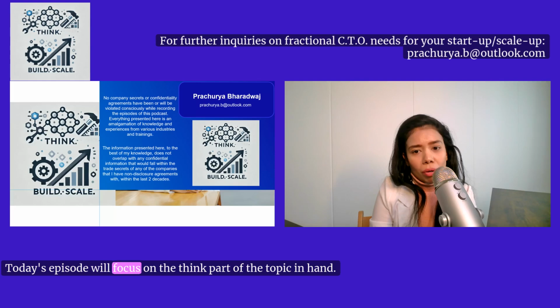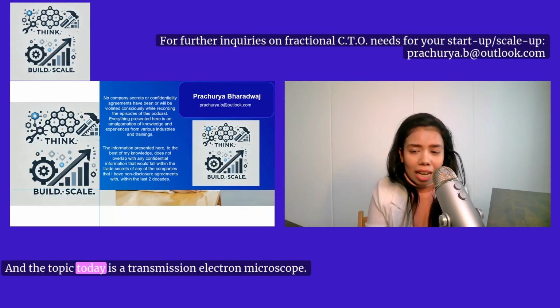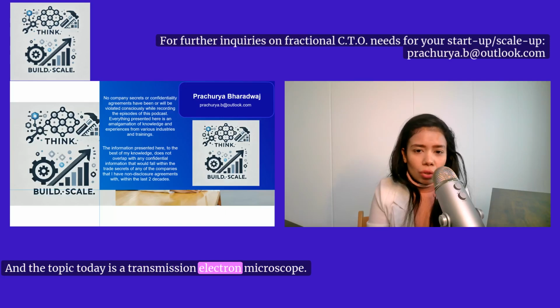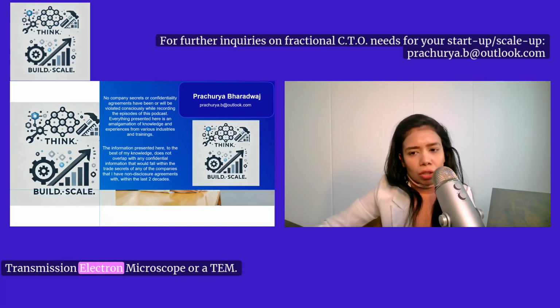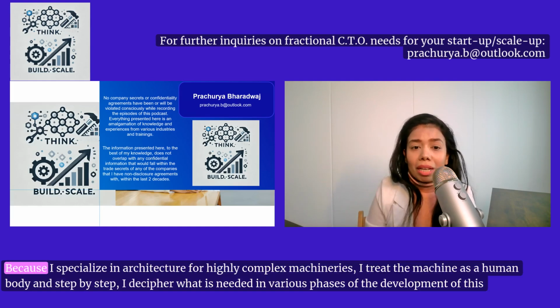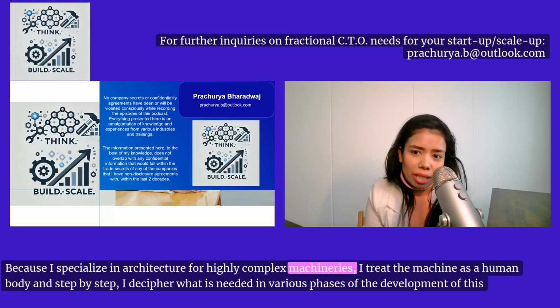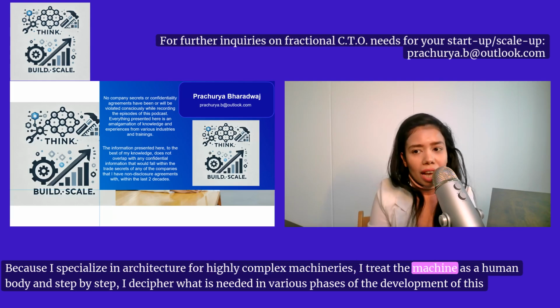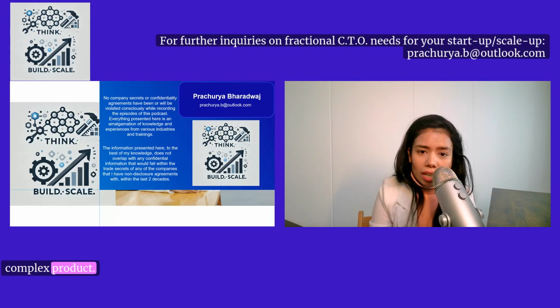Today's episode will focus on the think part of the topic in hand. And the topic today is a transmission electron microscope. Now, why did I choose a transmission electron microscope or a TEM? In this episode, we'll just call it TEM, because I specialize in architecture for highly complex machineries. I treat the machine as a human body, and step by step, I decipher what is needed in various phases of the development of this complex product.